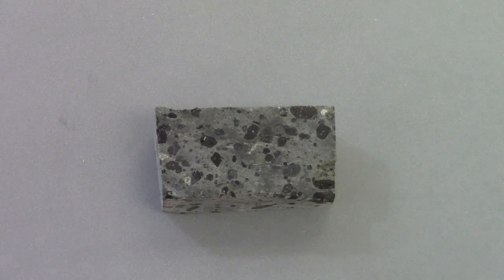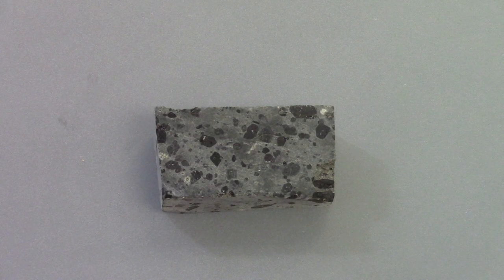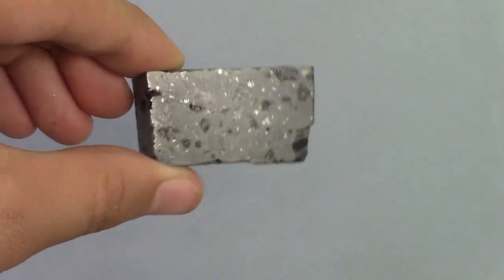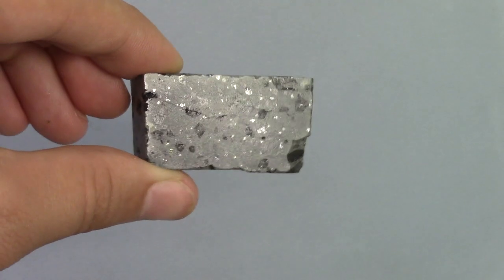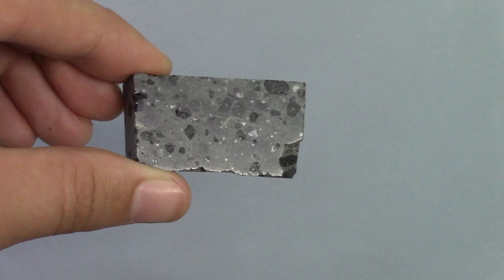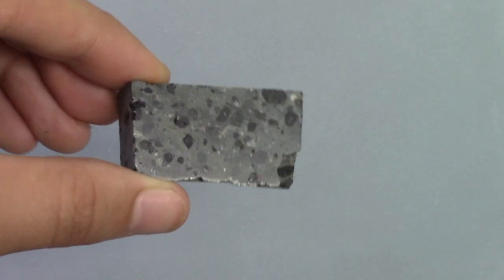This first one that we're looking at right now is actually polished pretty well. When you're polishing, this is what you should be doing from time to time so that you can tell if the surface has been polished smoothly or not. This one is nice and evenly shiny, the entire surface is flat, and so that's a good one.